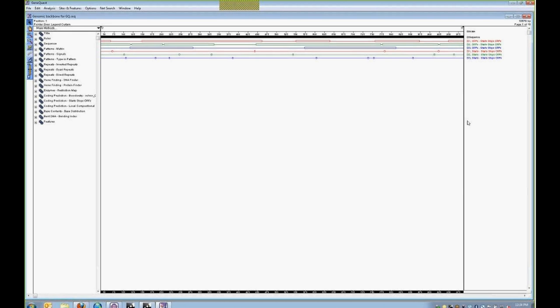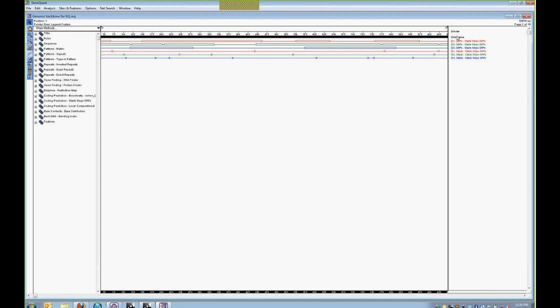But just real briefly, by default, the outline of what you're going to see in your assay table is a scale representing the scale of your sequence. This black bar, which is actually the sequence, it's just that we're zoomed out so far that it's represented as a solid black bar. If I were to actually select a region to zoom in, you could then see that particular sequence. But we're going to zoom back out just to give us a better view of our overall sequence. By default, we also have some open reading frames applied, as well as some start codons that are associated with the sequence.